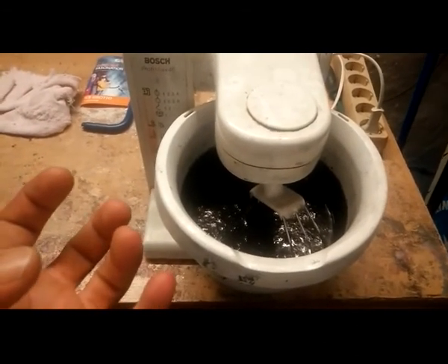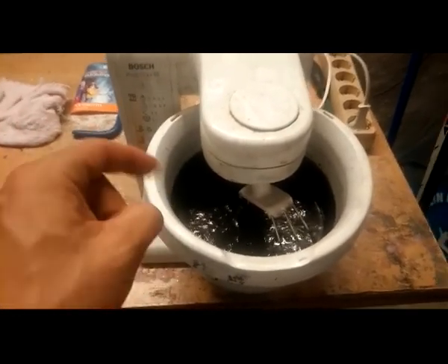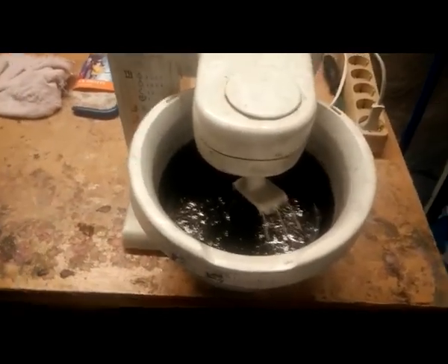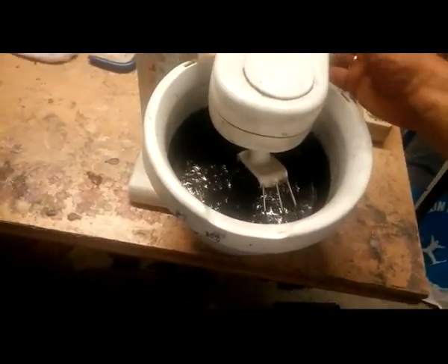When it's really a stiff sugar solution, I put the graphite in and let it run for some hours.